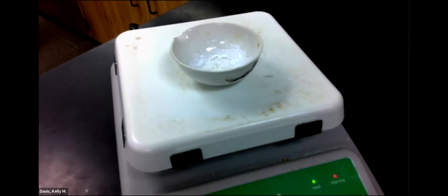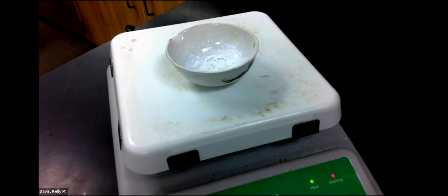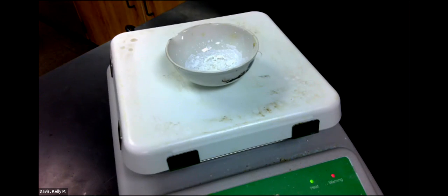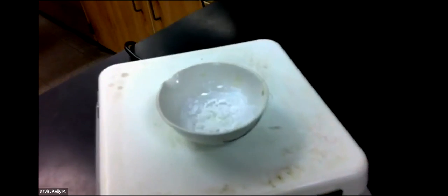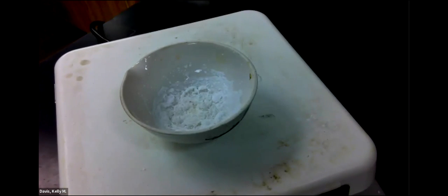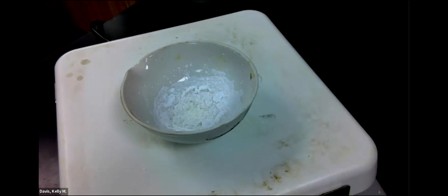If the mass drops a lot, it will tell us that we're still getting rid of water and we might want to heat it a third time. I don't really think that'll be necessary though. So it's pretty dry. There doesn't seem to be any water left. I'll just let it go for a minute and then I'll take it off again and cool it again.